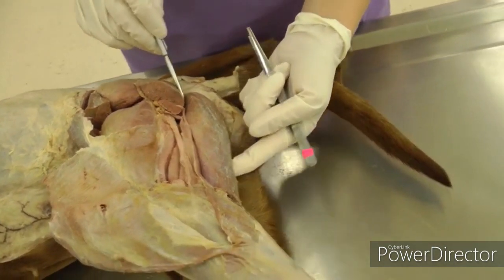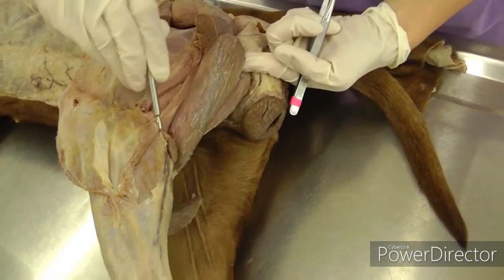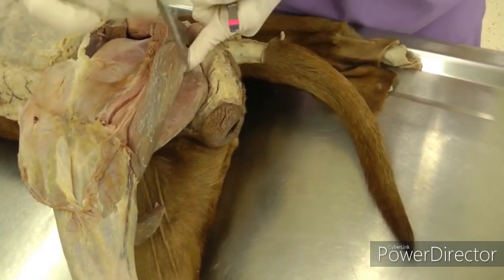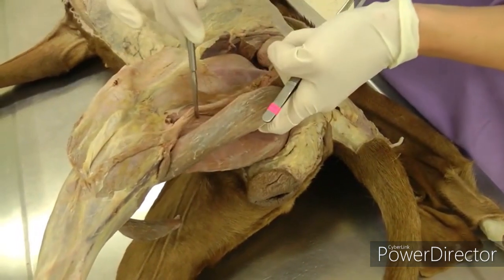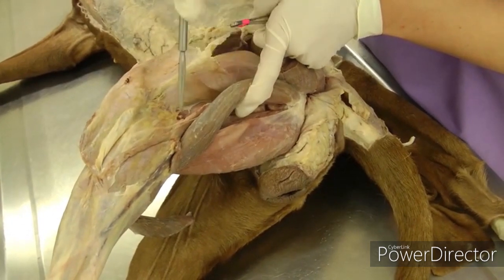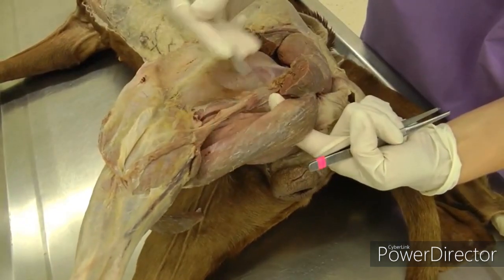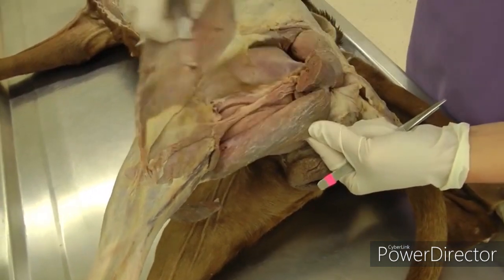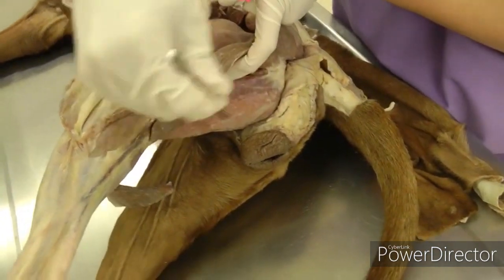Next, look at the semitendinosus muscle — it's kind of an oblong shape going all the way down. Then the semimembranosus, which is a lot thicker and has kind of two bellies that you'll see as you dissect it out — you don't have to differentiate or name them, but it is much thicker and fleshier than the semitendinosus. So: reflect biceps femoris, isolate semitendinosus, and identify semimembranosus.